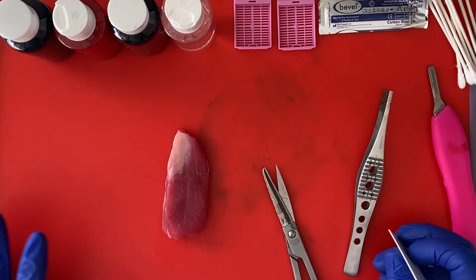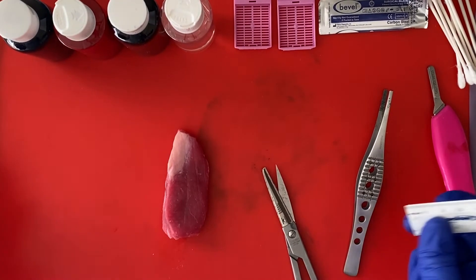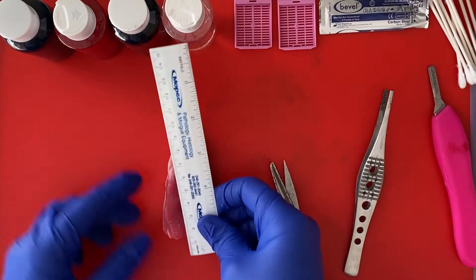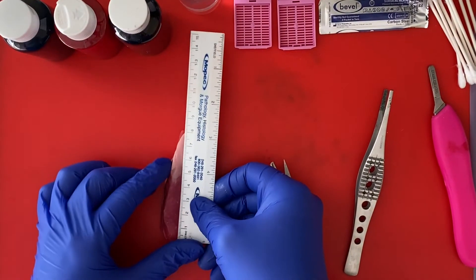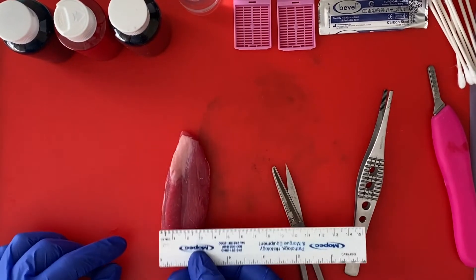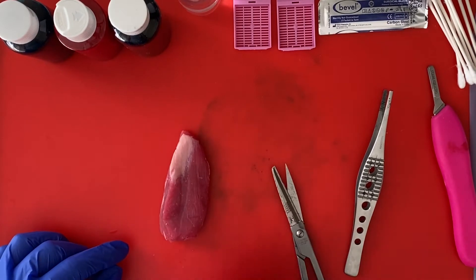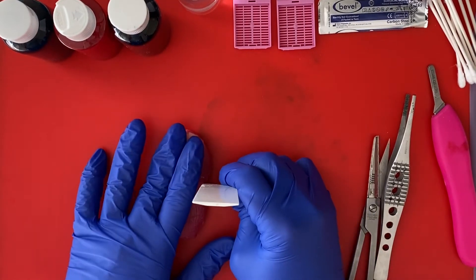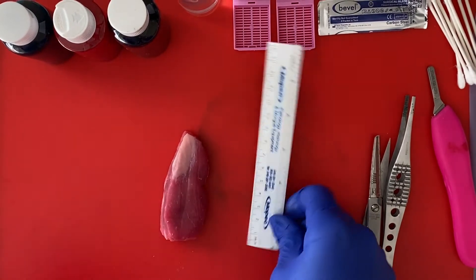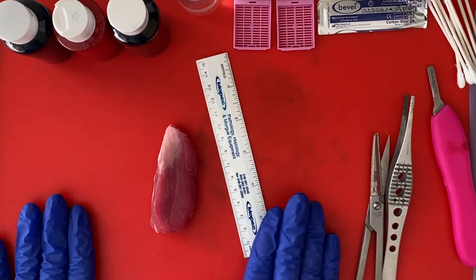Since this is just a single lobe and there's not a standard measurement for a single lobe, we don't need to weigh this. We're just going to measure it in three dimensions. It is 7.5 centimeters from superior to inferior, 3.5 centimeters from medial to lateral, and 1.8 centimeters from anterior to posterior.